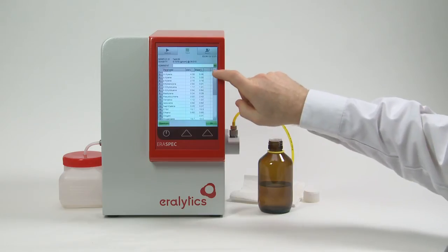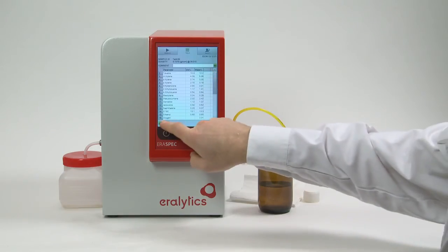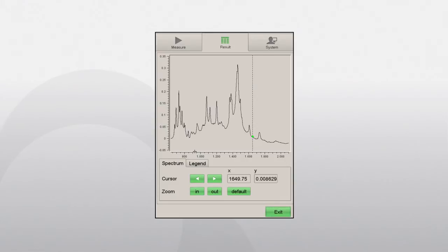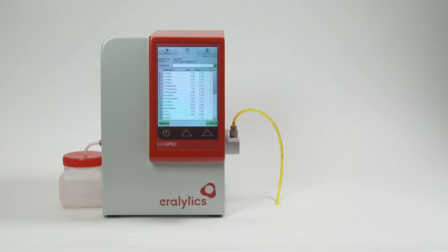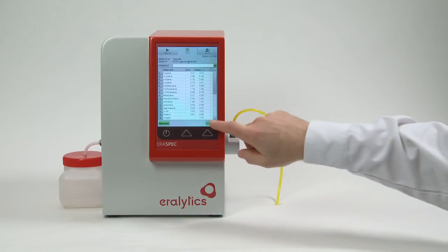To view the absorption spectrum of that sample, press spectrum. It is also possible to load other spectra from the result list for fast and easy comparison and analysis.